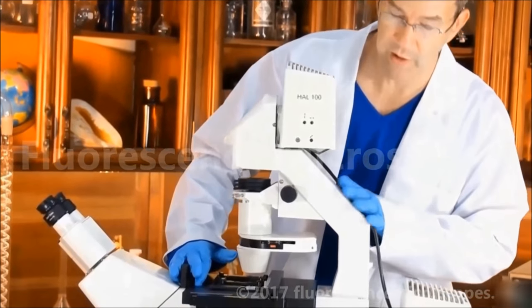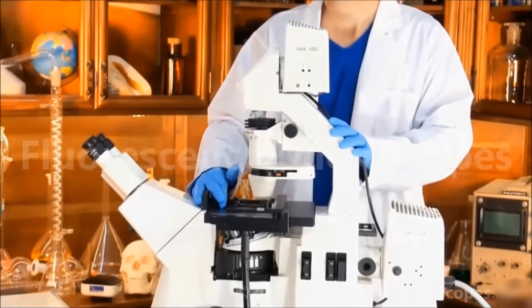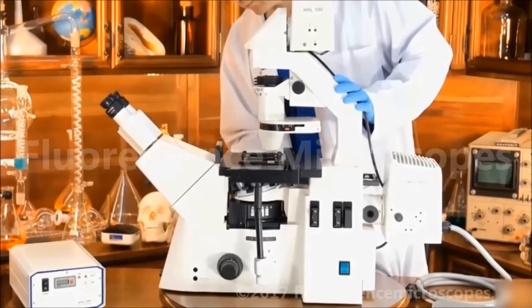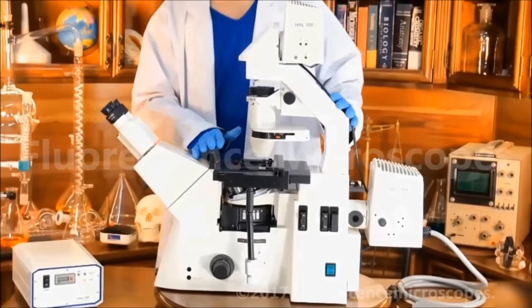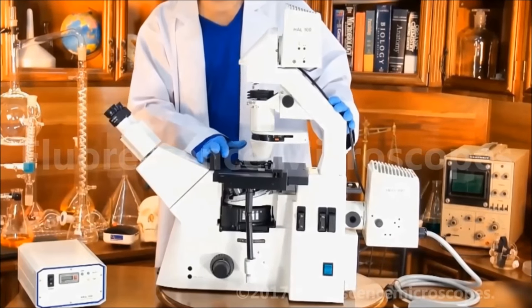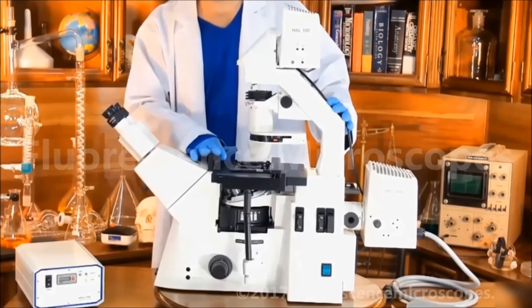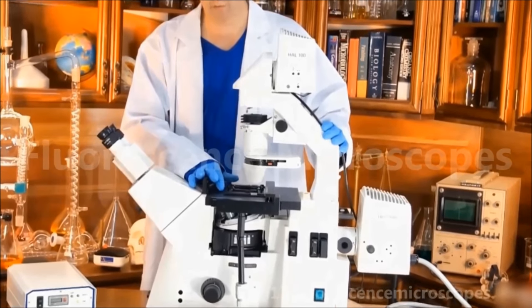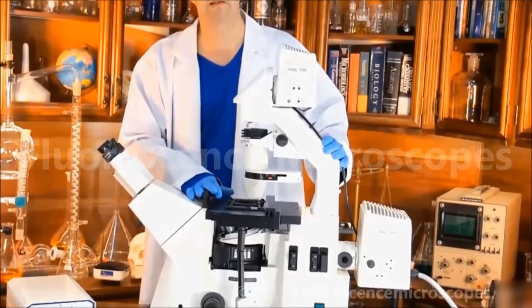If you need other objectives, let us know as well. These are long distance. That's how we're normally going to configure an inverted microscope. If you want to use slides upside down with a 0.17 millimeter cover thickness, let us know. We can provide high power objectives for that.